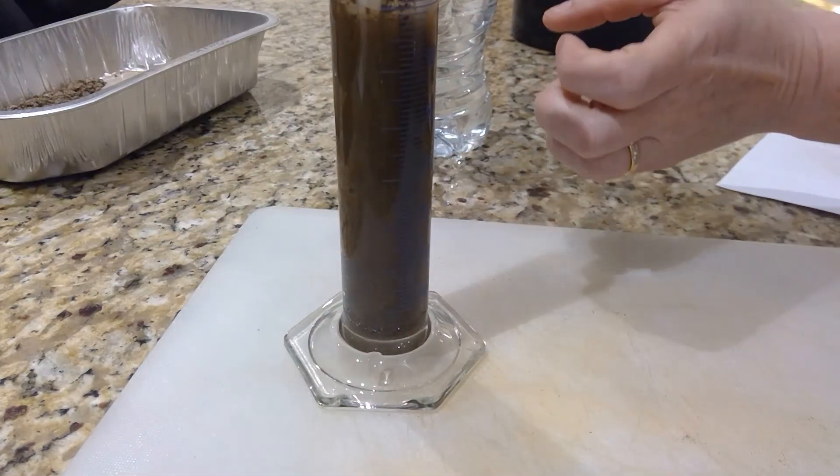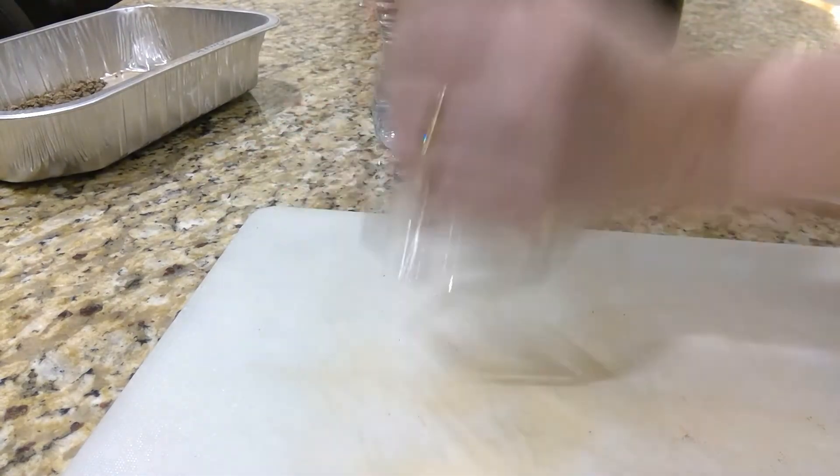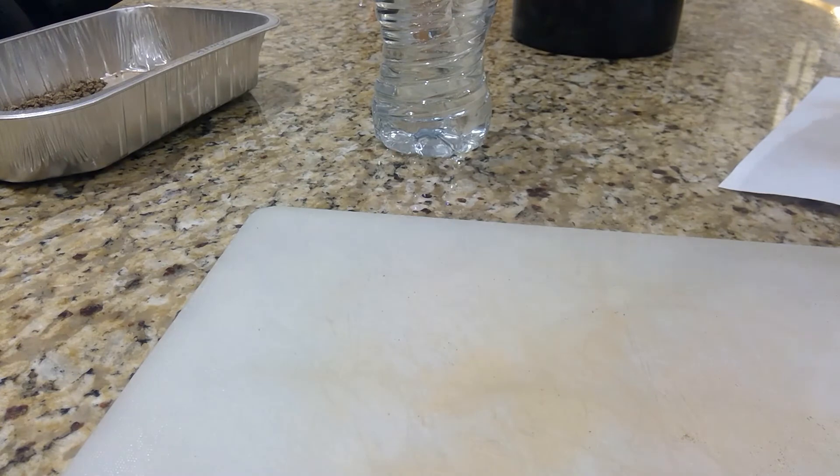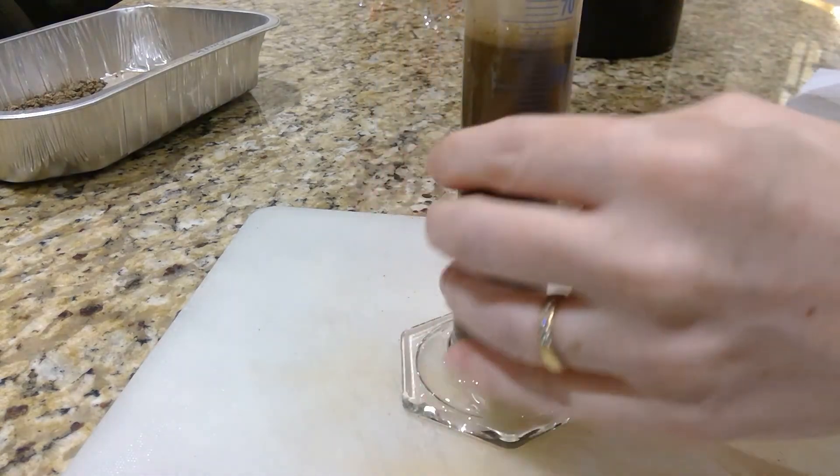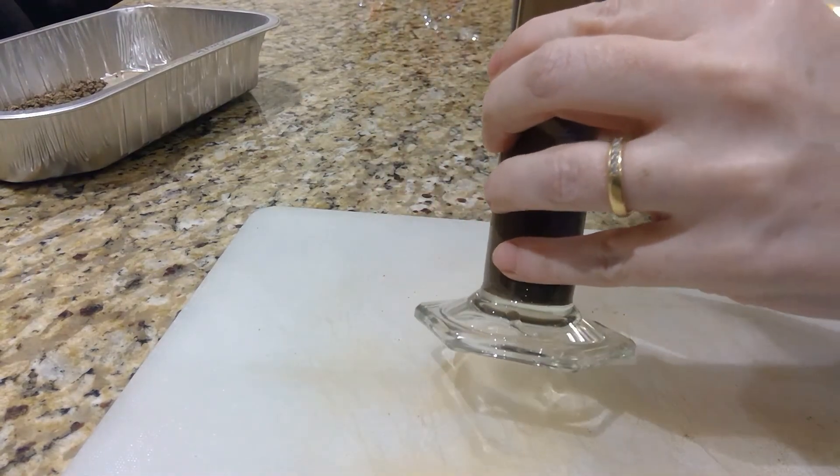What I'm going to do first is invert it a couple of times. The larger, heavier particles of sand will sit at the bottom, then silt — which is the next heaviest — will sit above that, and the clay will be at the very top.